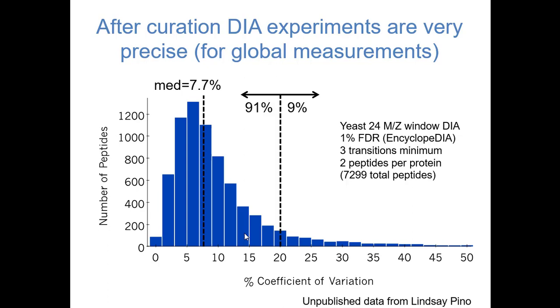If you wanted to do 10 replicates of 2 samples, that's a much harder experiment. Really, with TMT, you're limited to the 10 samples, or the 8 samples you can measure with TMT or iTRAQ. And so DIA, I think, makes it much easier for us to do large experiments that are spanning across weeks or months of acquisition, potentially. Okay.